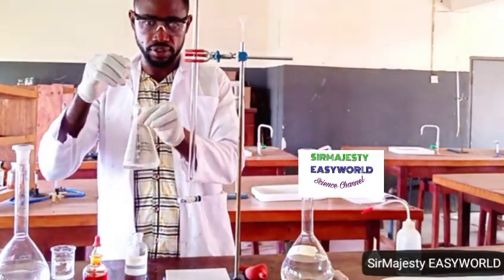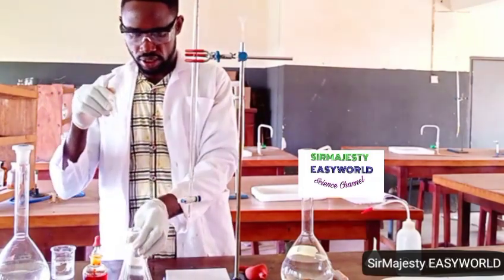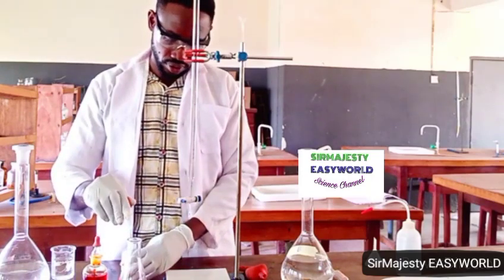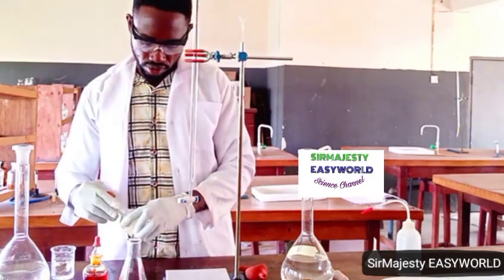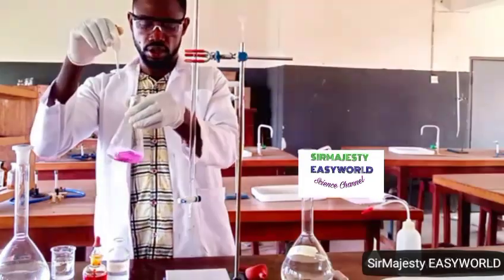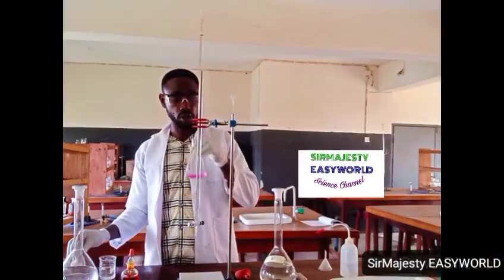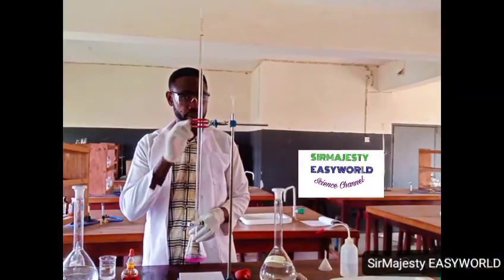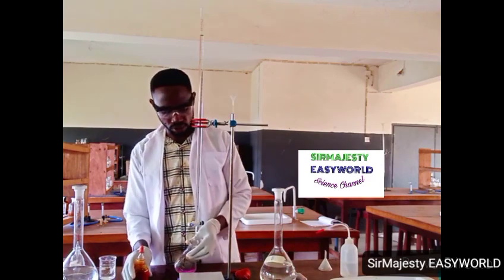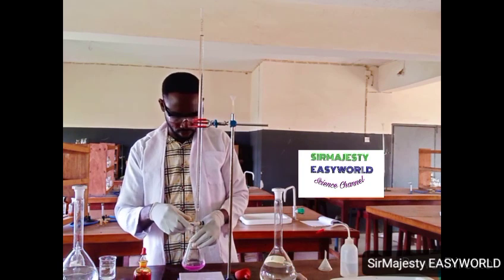So I'm using phenolphthalein first. Add it enough. So when it becomes colorless, I will stop and take the reading, then add another indicator, which is methyl orange, and continue. My initial reading here is 0.00.